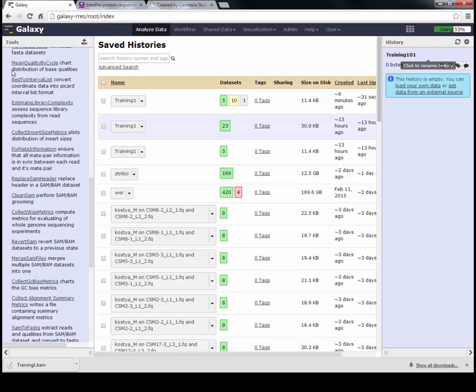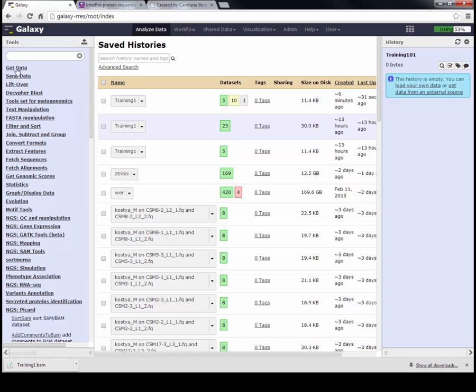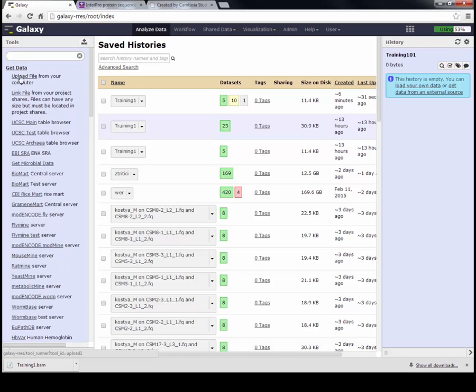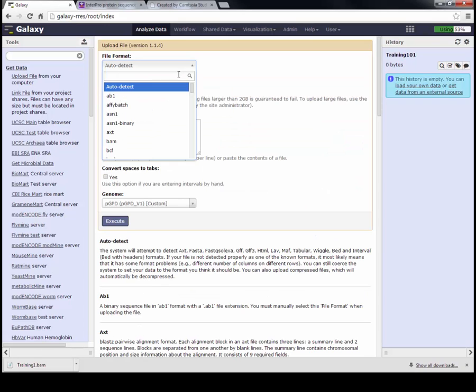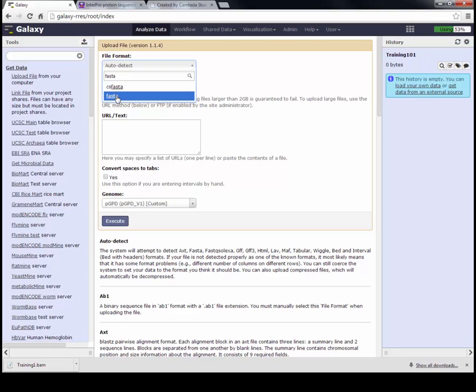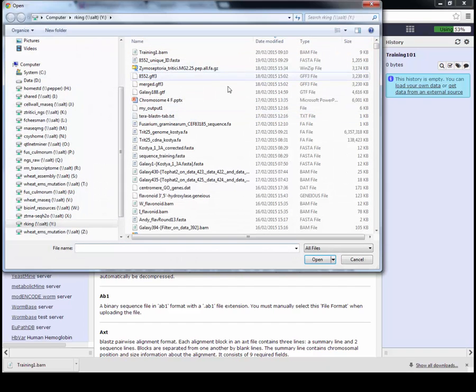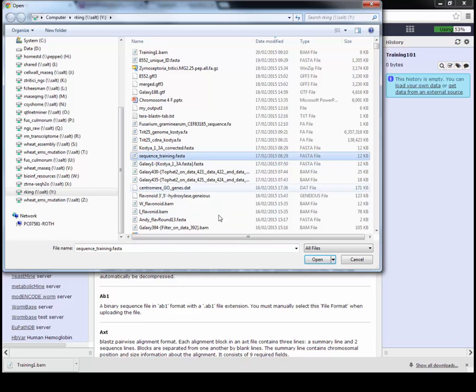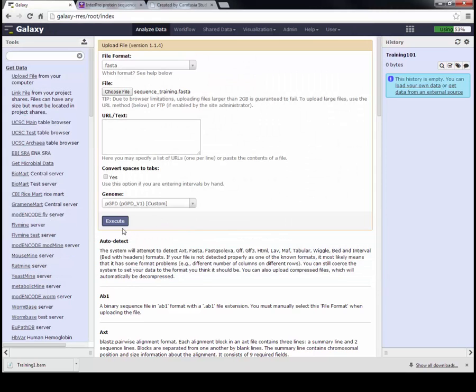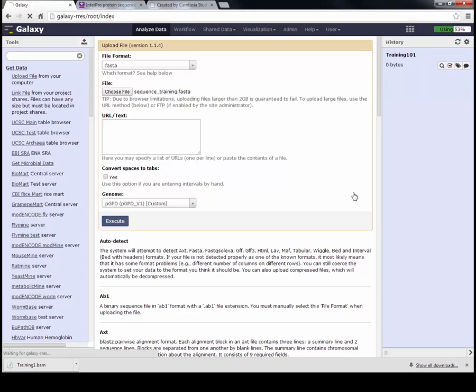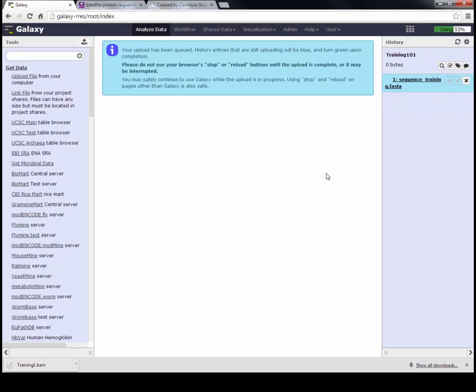Now I've got this new history. I need to import the contig or DNA sequence which I'm going to map against. Go to Get Data, Upload File. You need to select what format - type FASTA, because most DNA sequences should be in the FASTA format. Go to Choose File and select the file that you're going to import. Sequence Training.FASTA is what I'm using. Press Execute, and then that file will begin to be uploaded.